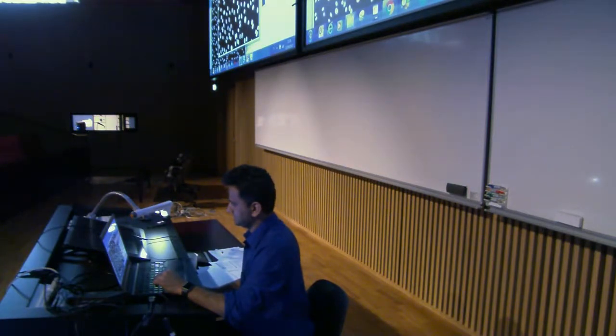Not here actually. Analyze, set measurements. In the set measurements, you can tell what kind of features you want to extract. So this area, standard deviation, mean gray intensity, but here there is this selection on which you want to apply.